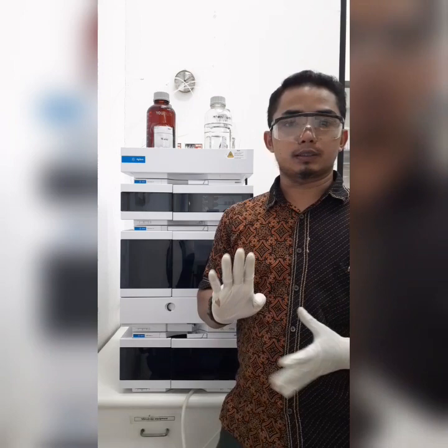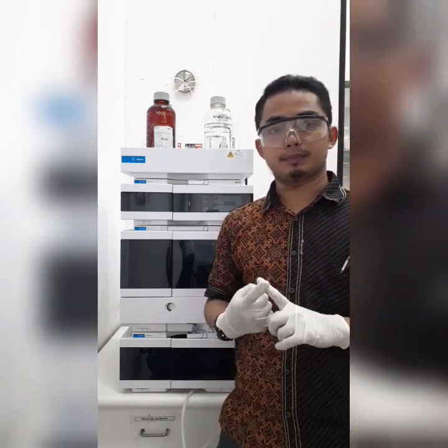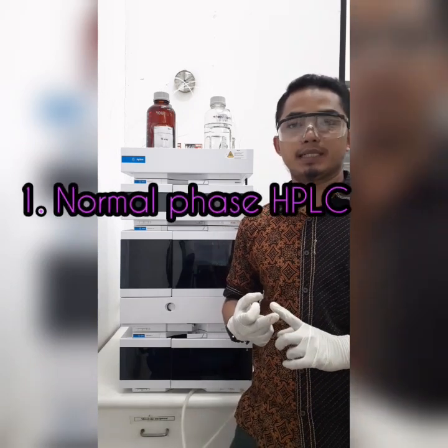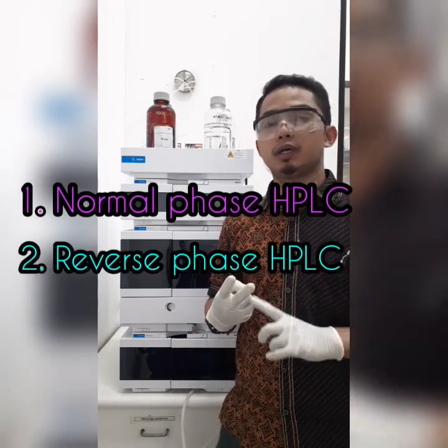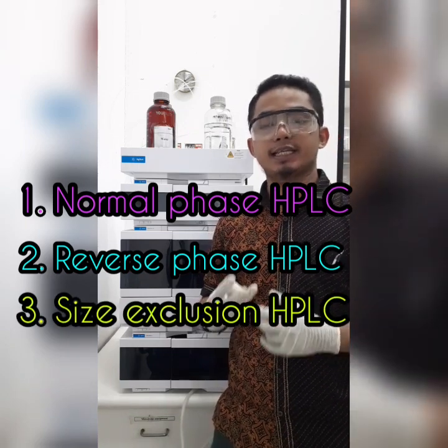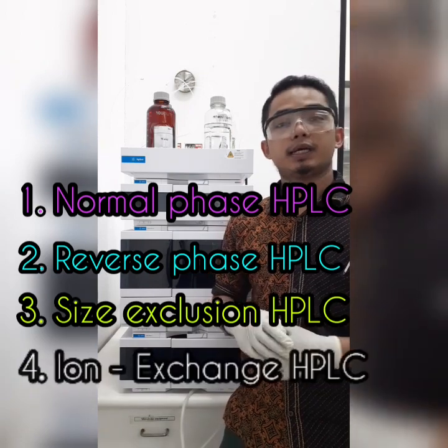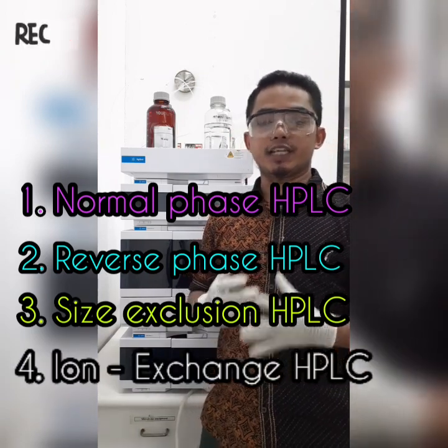There are 4 variants of HPLC system. Number 1, normal phase HPLC. Number 2, reverse phase HPLC. Number 3, size exclusion HPLC. Number 4, ion exchange HPLC.